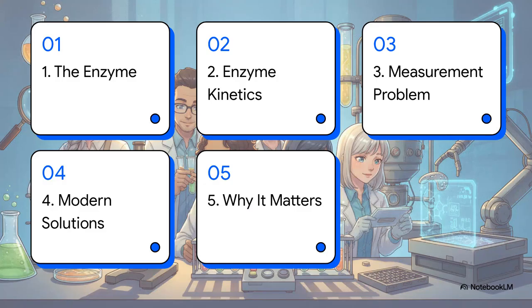To make sense of all this, we've got a quick roadmap. Today we'll cover 1. The enzyme keeping us alive. 2. Enzyme kinetics explained. 3. The measurement problem. 4. Modern solutions and assays. And finally, 5. Why measuring catalase matters.